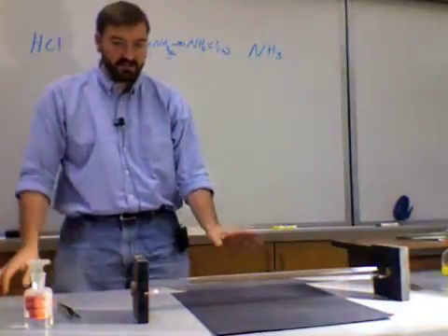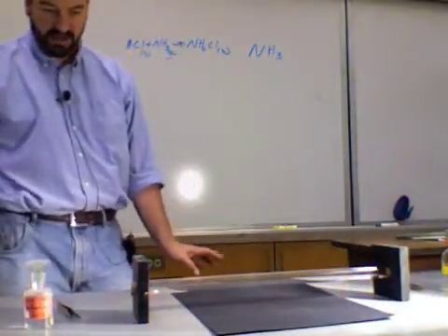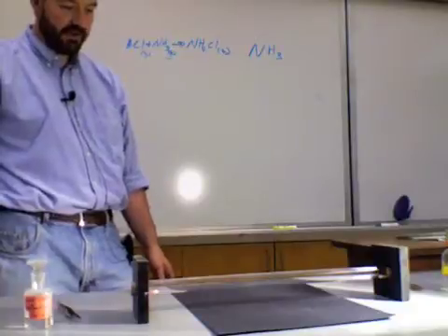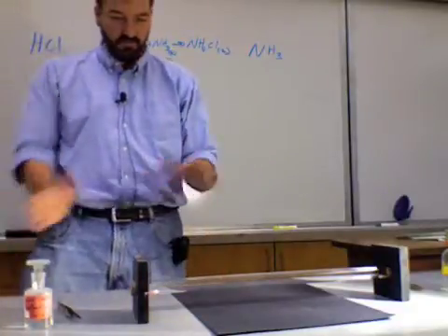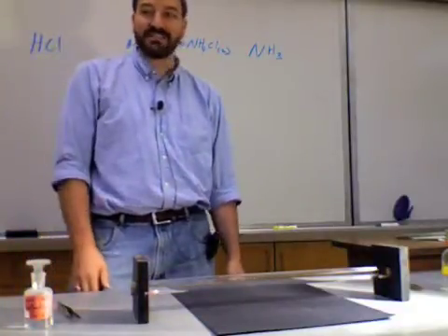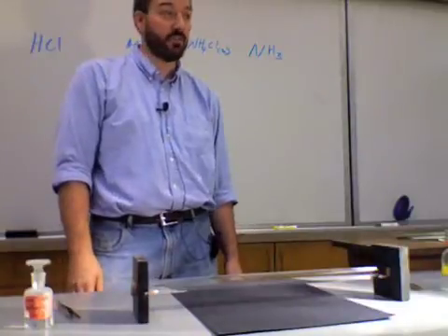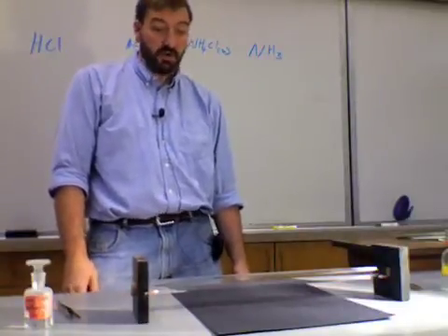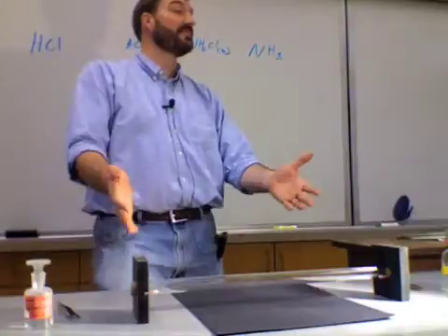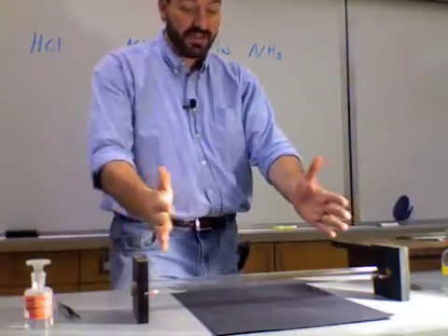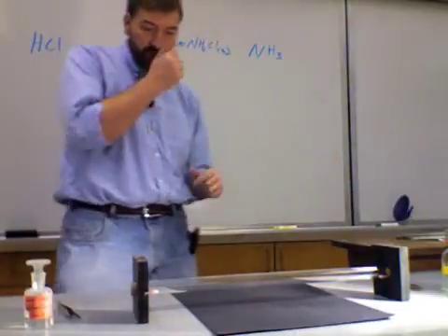Adjust this a little bit so we can see the tips there. So now what we do is we kind of sit, and we wait, and we watch for a minute. We're going to try and figure out where these two things, where this gases are meeting. We're looking for the formation of a white solid. So this is not an instantaneous process, right? It takes time for the two gases to begin to diffuse through here.